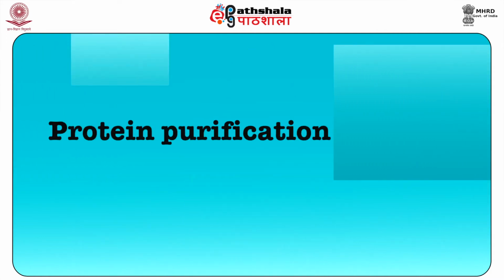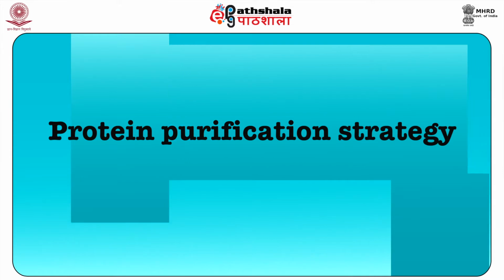Now let's look at what is the protein purification strategy. As we know after reading the previous modules, most of the enzymes are proteins. Now the purification and extraction methods employed for enzymes are same as that of proteins, because enzymes are essentially proteins only. To study an enzyme's function, it is essential to obtain what is known as a pure preparation, a homogeneous preparation from cells which contain a multitude of other proteins and even enzymes.